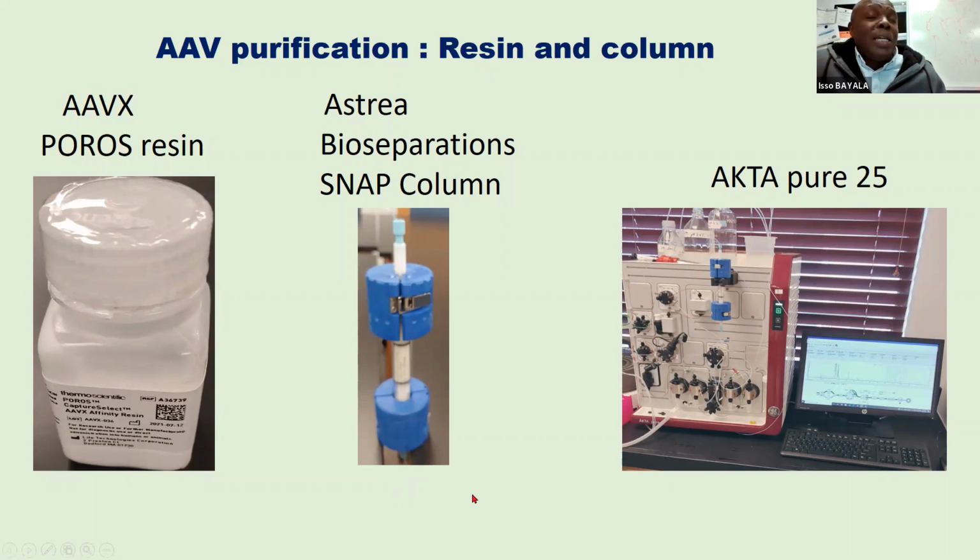various particles. Here, if you're gonna do this, you want to be careful because the protocol given by Thermo Fisher did not work well for me. I had to modify it because I was collecting the wrong fraction. And when I ran the qPCR, I was not seeing any signal because I was not collecting the right fraction during the elution.